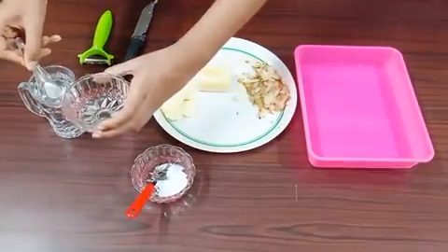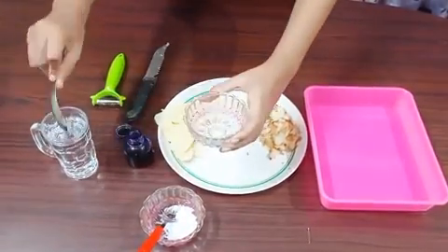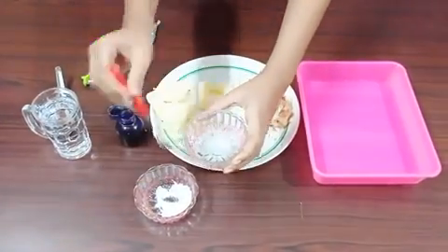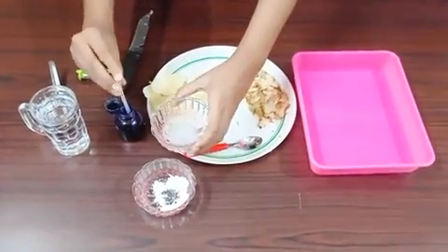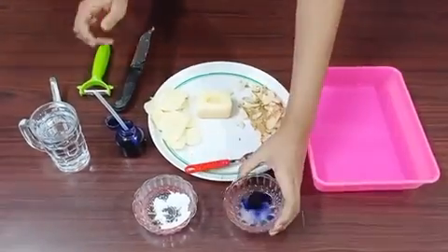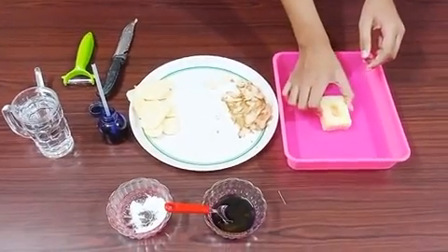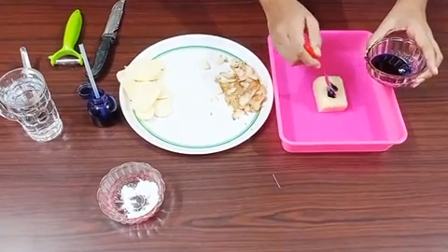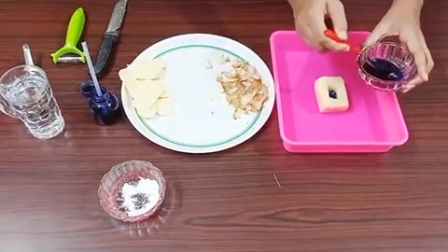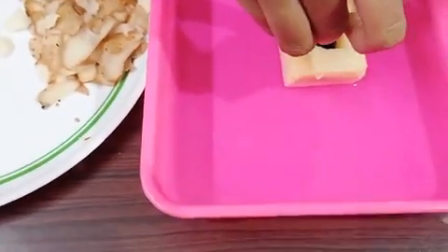Now we have to prepare a high concentrated salt solution. Add few drops of ink to make it a colored solution. Now place this potato osmometer in the water containing tray. Pour few drops of this concentrated colored solution into the cavity of this potato osmoscope. Mark the initial level of this solution with this pin.